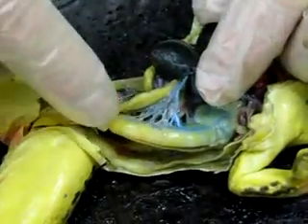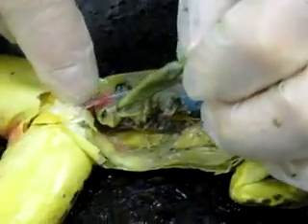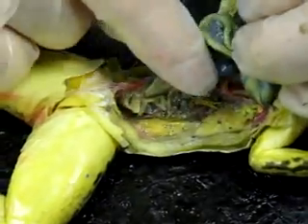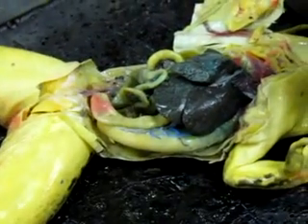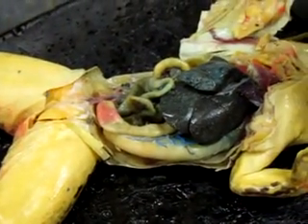Esophagus, stomach, pyloric sphincter, duodenum, ileum, held in place by the mesentery, the colon, the cloaca, urinary bladder, kidneys, spleen, liver, and gallbladder. All those are parts of the digestive system. Okay? Next will be the circulatory.